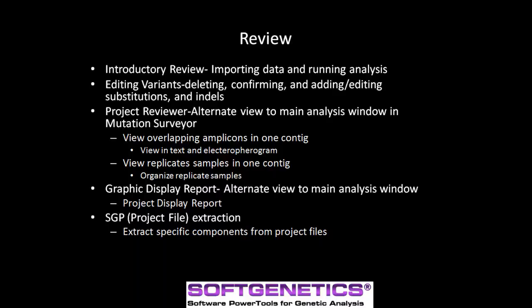To sum up the webinar, we quickly went over how to import data and run the analysis. After the analysis, we discussed the color coding scheme and how to manually edit the mutation if needed. Then, the project reviewer was used to assemble overlapping amplicons in one window. The grouping tool within the project reviewer allows you to group replicate samples by specific characters or sample ID. The second data analysis method discussed was the graphic display report, which shows alignment and mutation calls for specific contigs in the project. The project display report showed all the separate contigs in one window. And finally, we talked about the project file extraction tool, which is used to export specific components from a single project file.